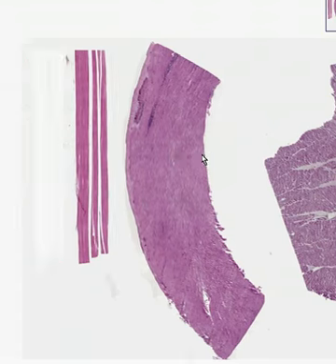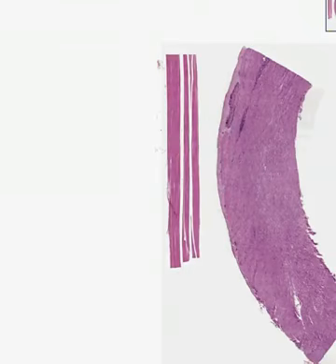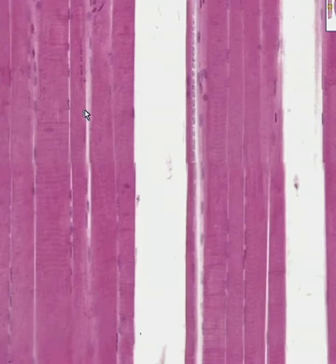Let's go to the first one on the left, and let's zoom it up a little bit. And you could quickly see, I hope, that these fibers here are clearly striated. In addition, they are arranged very longitudinally, like logs on a neatly stacked fireplace. In addition, you can see that the nuclei are all out at the periphery. So this is classical voluntary skeletal striated muscle.